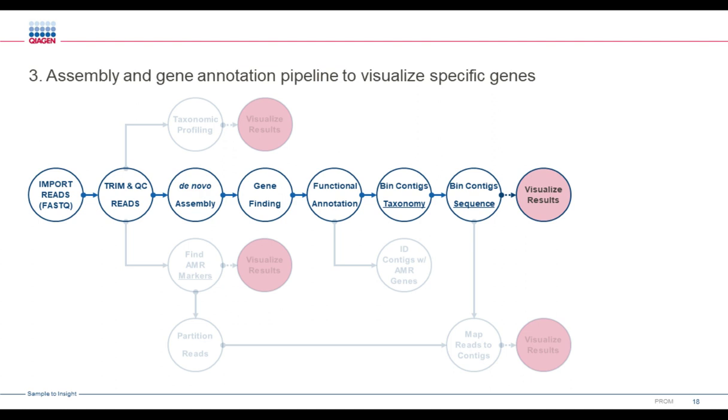And if I can't accurately classify an individual contig, is there perhaps another way that I could bin them based on other sequencing characteristics like GC content, tetramer frequency, depth of coverage of the actual reads, etc.